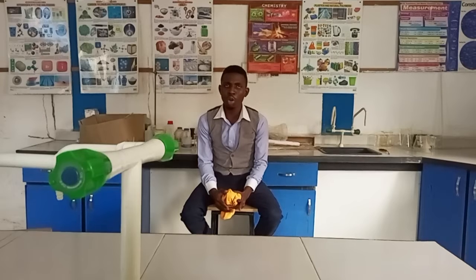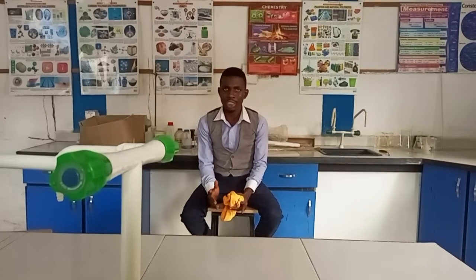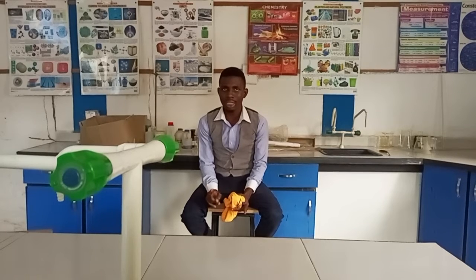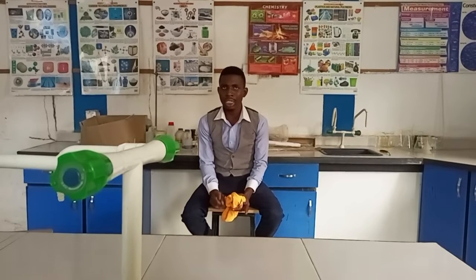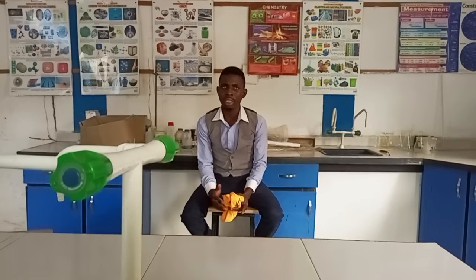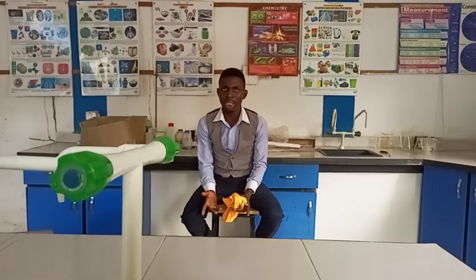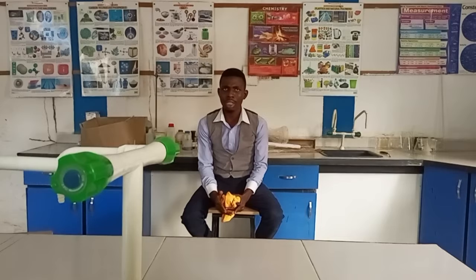But if you are titrating a strong base against a weak acid, you are expected to use phenolphthalein. But in a situation when you have a weak acid and a weak base, there is no suitable indicator for the experiment.